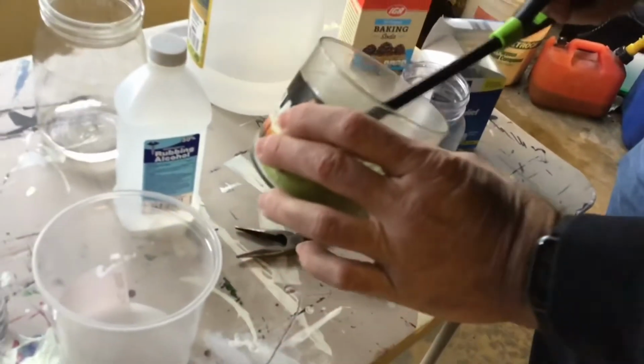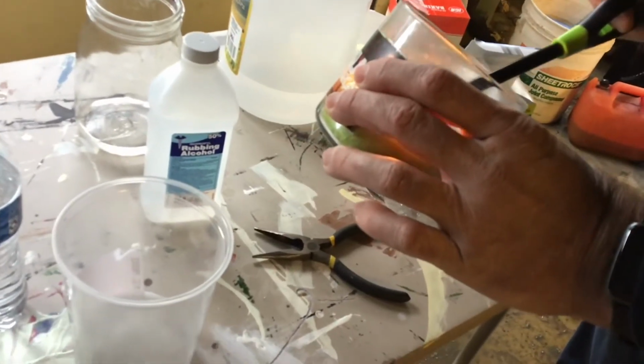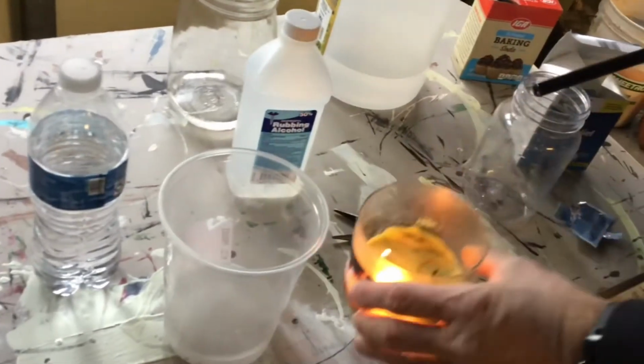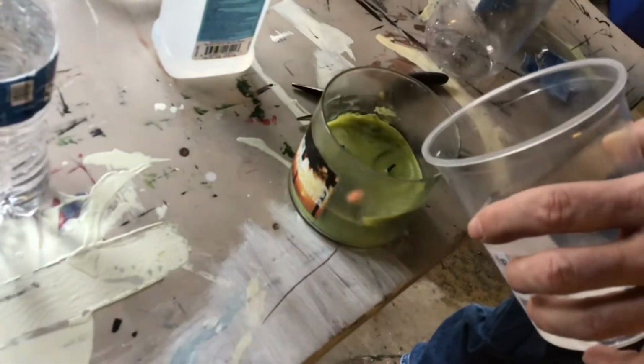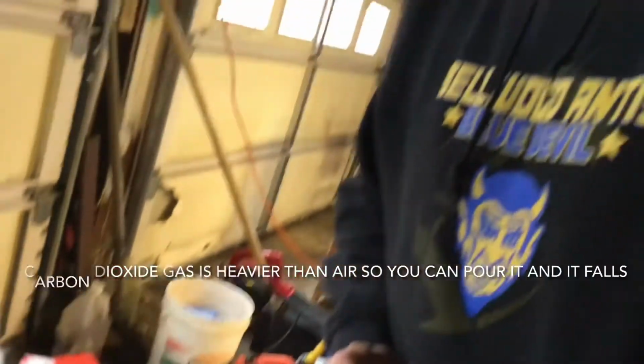So in stopping combustion, you can actually pour carbon dioxide gas, if I collect enough of it in there. And as I pour it, without pouring the liquid out, it should put out the fire. That is production of a gas that you couldn't see that put out my candle.